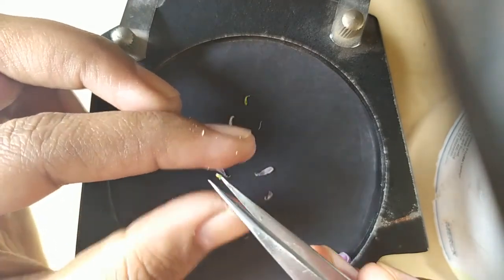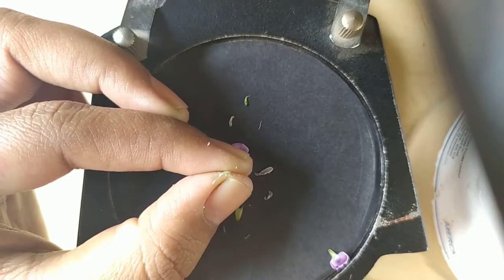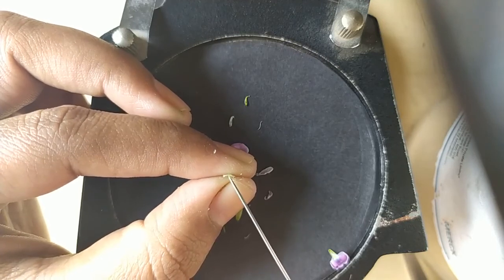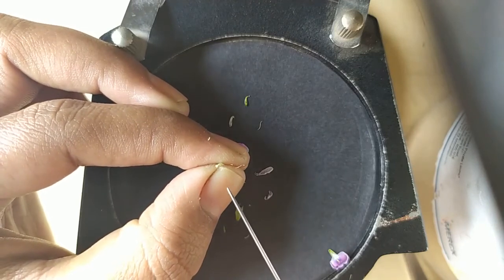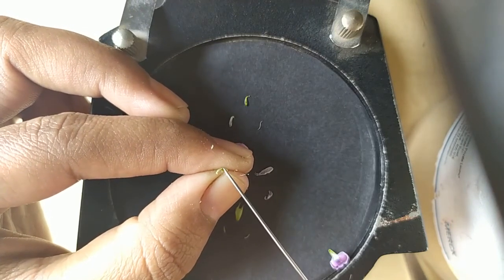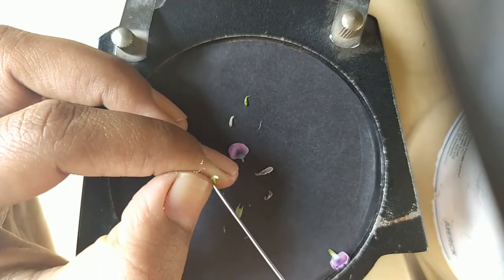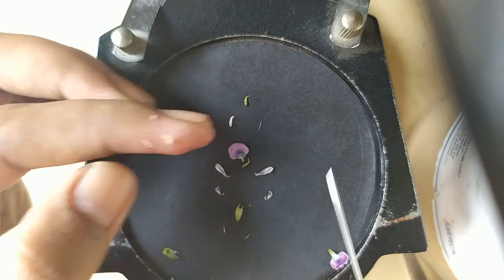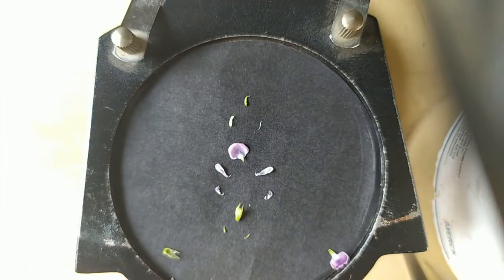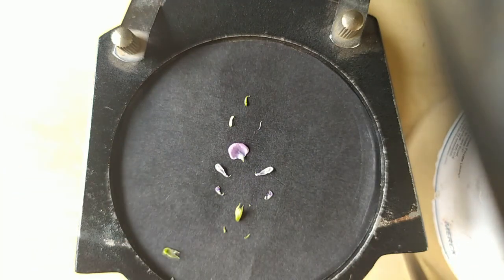The innermost portion which remains here is your androecium and gynoecium, and at the base one single anther is attached. See here, one anther gets separated, this one. Inside the bunch of 9 anthers there is the gynoecium, which is greenish. Then remove this gynoecium. So it is an easy dissection. In that way you proceed with your dissection and paste the different parts of soybean on a mounting sheet. Thank you.